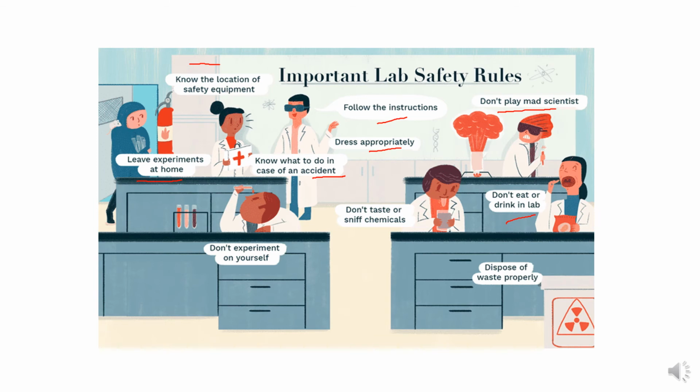So eating, drinking, and anything like using cosmetics is not allowed in the lab. Don't taste or smell any chemicals. Of course, they contain different vapors or aerosols, and they can cause dizziness, or maybe you have an allergy, and it can cause epilepsy or diabetes-like issues. Okay, so don't experiment on yourself, as I mentioned here.